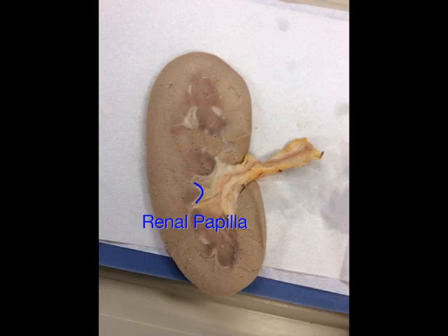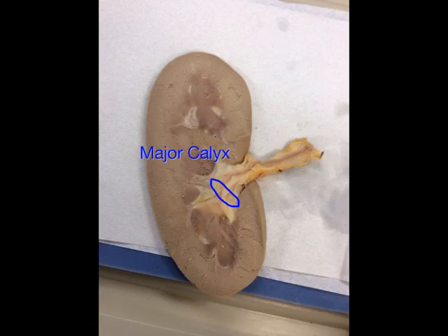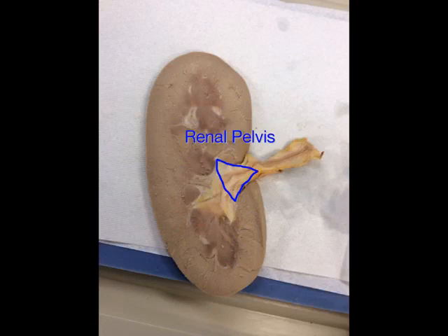At the end of a renal pyramid is the renal papilla. After the renal papilla are the minor calyx. Merging minor calyces forms the larger structure called the major calyx. And finally, all major calyces merge to form the renal pelvis.